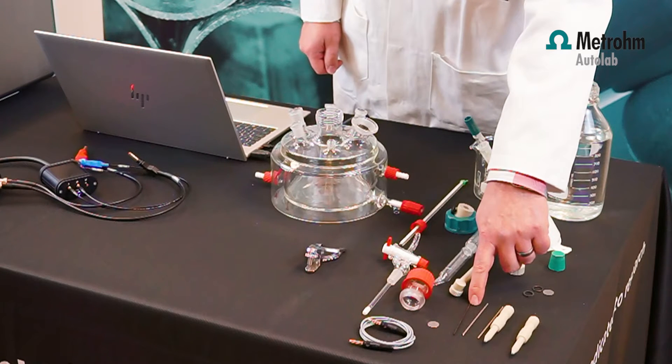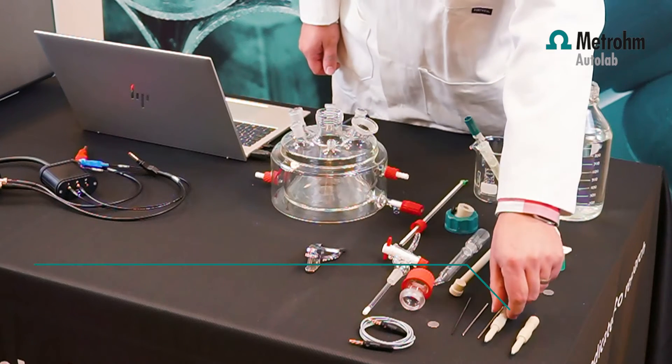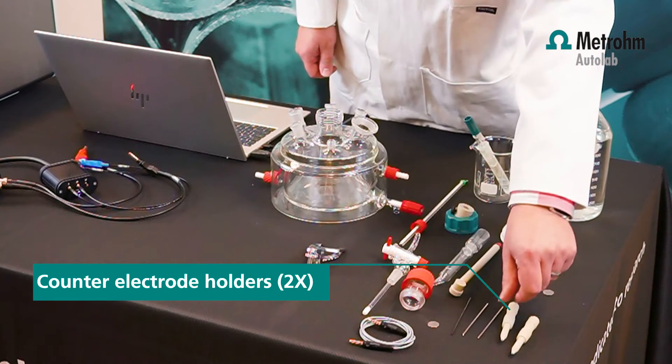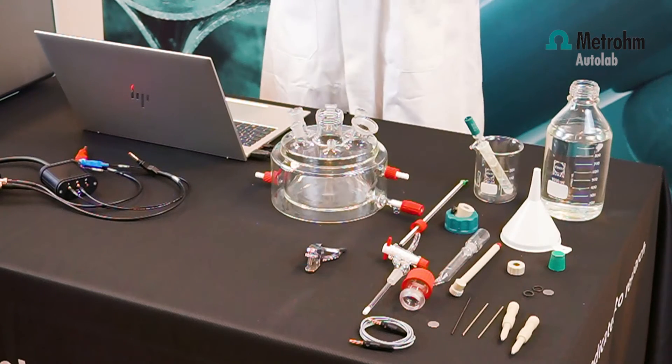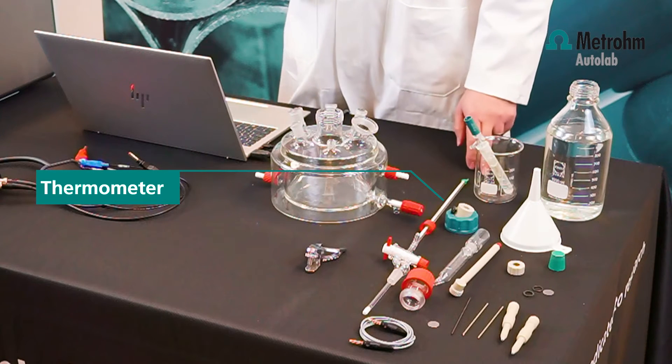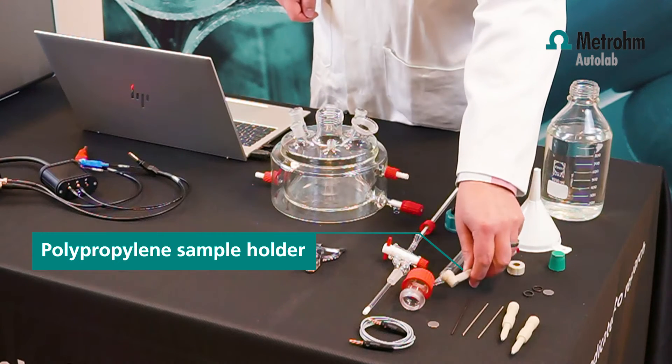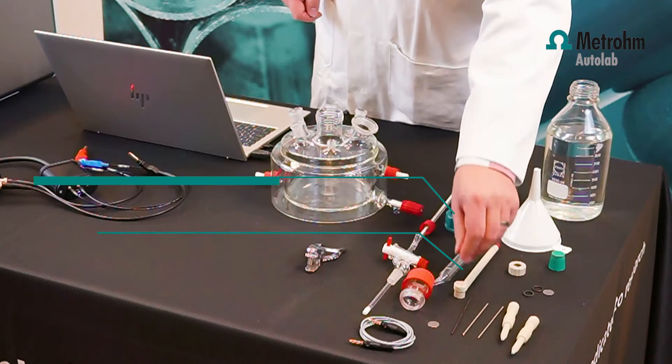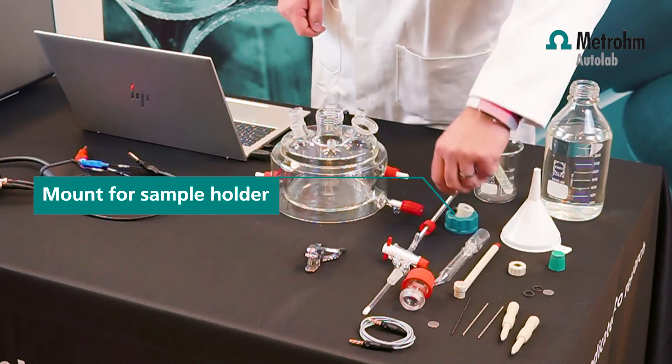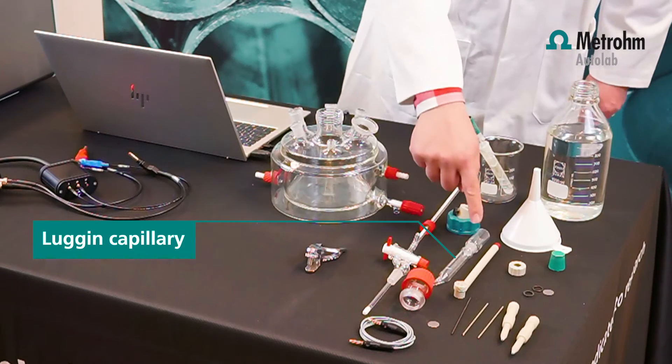The stainless steel rods are replaceable with glassy carbon rods while the same electrode shafts can be used. You have two electrode shafts. Then we have a thermometer that goes from 0 to 150 degrees centigrade, a polypropylene sample holder, and a mount for the sample holder.